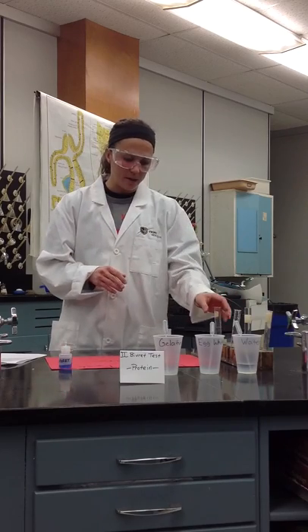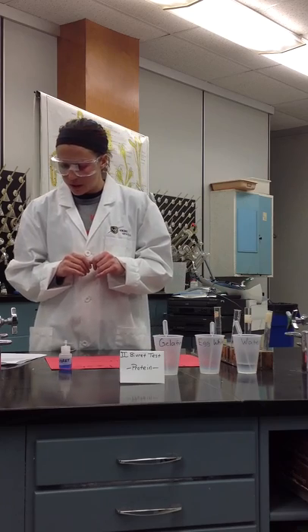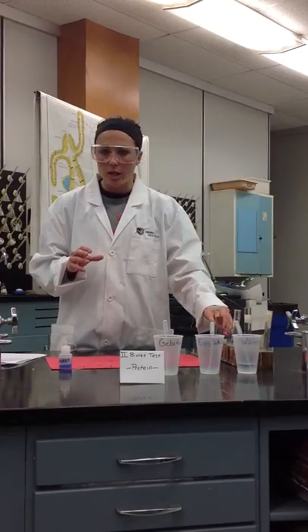Once you've added that to your test tubes, the test results are a little tricky to read on this one. It says biuret will cause the substance to gel up and become almost a solid in the presence of protein. It'll also turn a blue-violet color in some cases. So when you swirl it around, you're going to be looking for a change and looking to see if it kind of forms a gel in the bottom of your test tube. If it does, then you have a positive for protein.